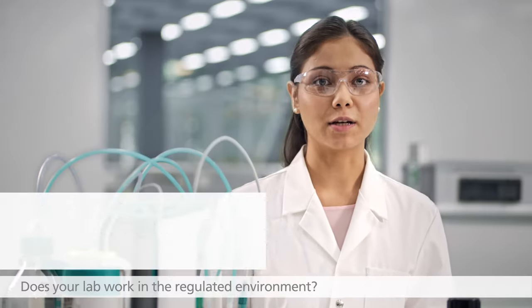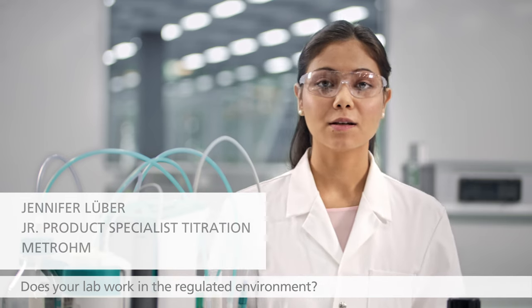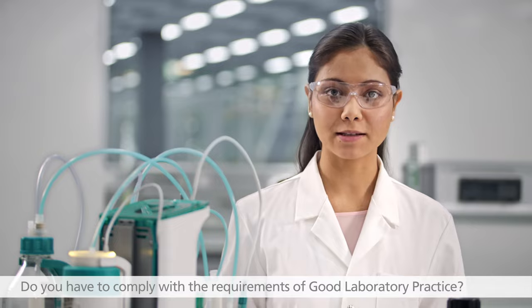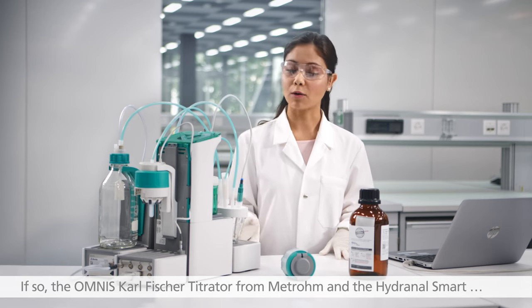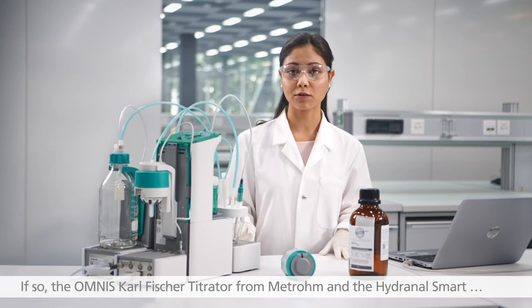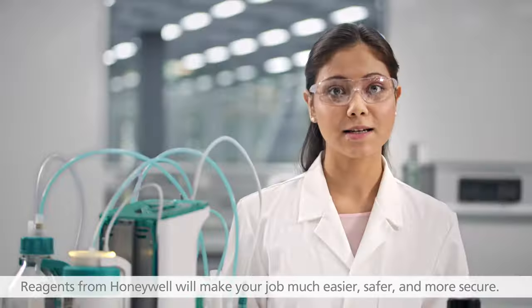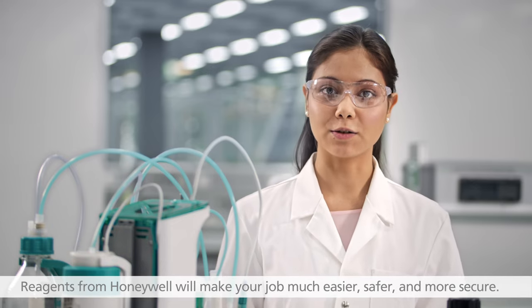Does your lab work in a regulated environment? Do you have to comply with the requirements of good laboratory practice? If so, the Omnis Karl Fischer Titrator from Metrohm and the Hydranal Smart Reagent from Honeywell will make your job much easier, safer and more secure.